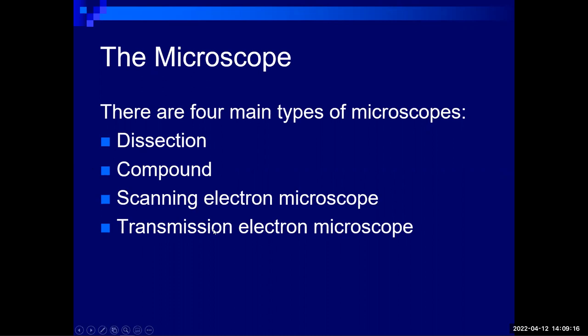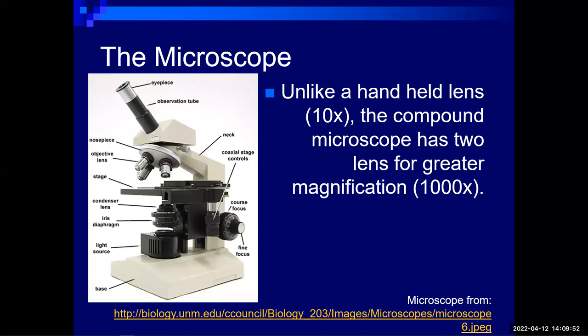When I was at university, they actually had to get a grant written for a couple hundred thousand dollars that covered the cost of the salary for the person to operate the scanning electron microscope, and also the maintenance of the microscope itself. So it's very expensive in terms of its acquisition and maintenance, and thus far, it's beyond the scope of COSTAT. So we'll just rely on other sites to produce the images until perhaps we could move towards that stage. Let's have a look again.